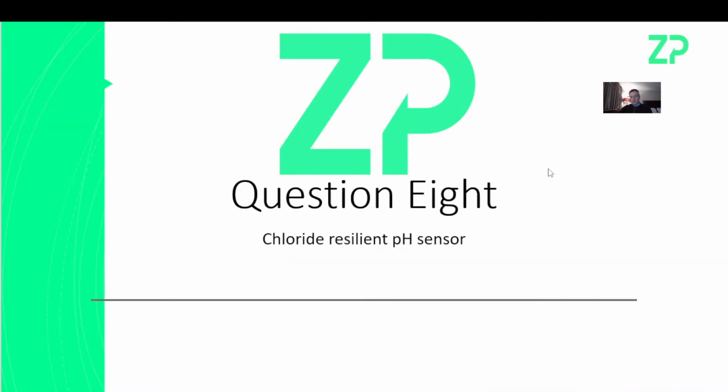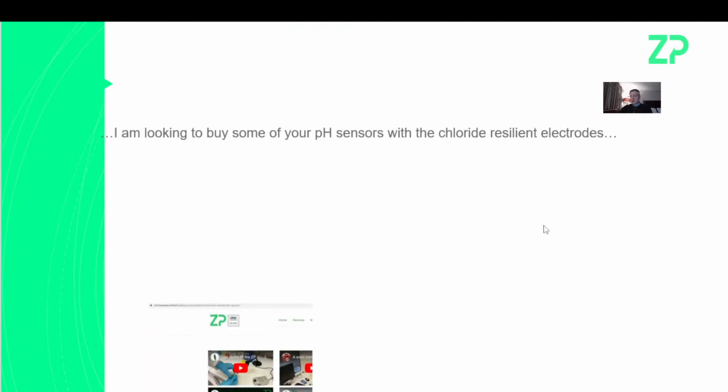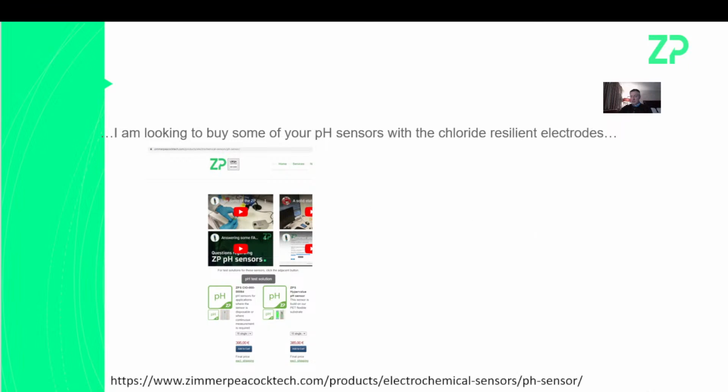The last one, there's a couple more questions. This one is about measuring pH using what we call a chloride resilient pH sensor. The person was actually struggling to find it, so I have put a link. The link is underneath the video, so follow the link.